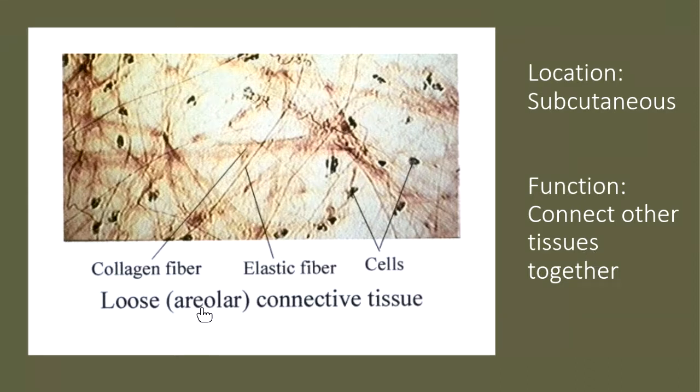Remember, when we're talking about any tissue, especially connective tissues, we've got three components. We've got cells, and we can see these cells here in these labels. We've got fibers here. These hair-like fibers are elastic fibers, and these thick fibers are collagen fibers. And then we've got the matrix, and here in the background we can kind of see this clearish matrix. This is actually hyaluronic acid, so you may have heard of that term. I know I've heard it on some hand cream commercials. Here, hyaluronic acid is something that helps really super glue some of those other tissues together.